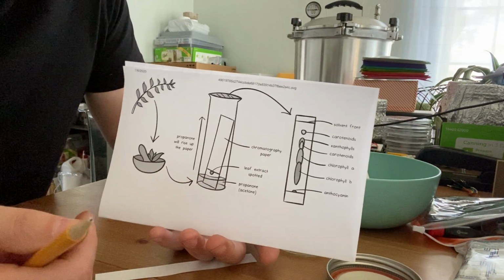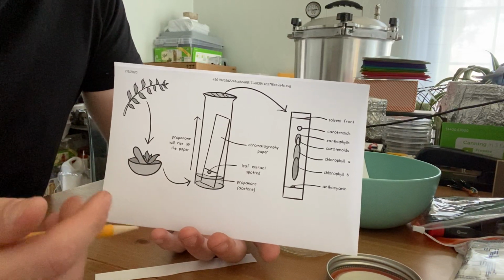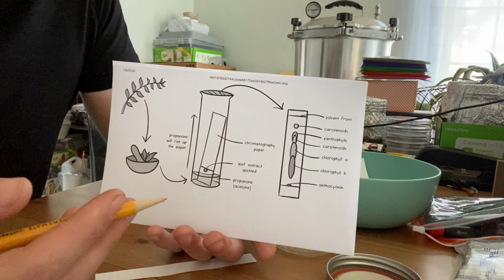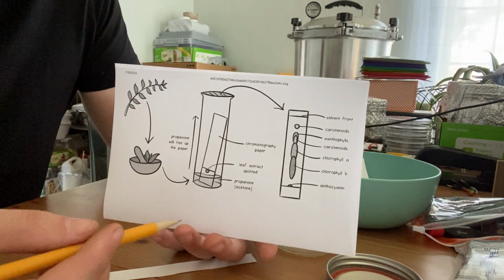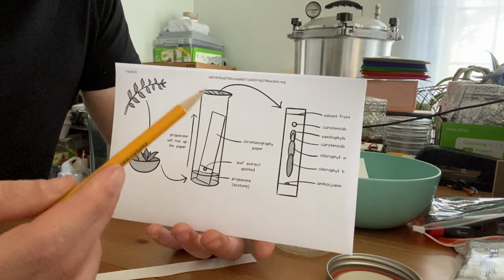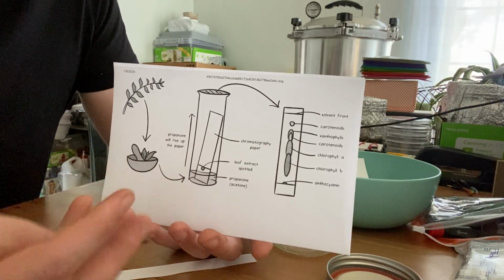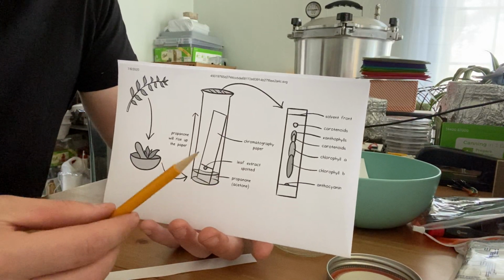Well, one of the things that I've observed with commercial and amateur mushroom growers is they're often focused on breeding the most desirable physical phenotypes, physical characteristics of the mushrooms. But there are a lot of mushroom growers that are selling gourmet and edible mushrooms because of their medicinal properties. Cordyceps have things like cordycepin in it, which is shown to improve oxygen uptake in red blood cells. But there doesn't seem to be a great way for mushroom growers to quantify those valuable and medicinal compounds inside the mushrooms. So thin layer chromatography can aid in that.